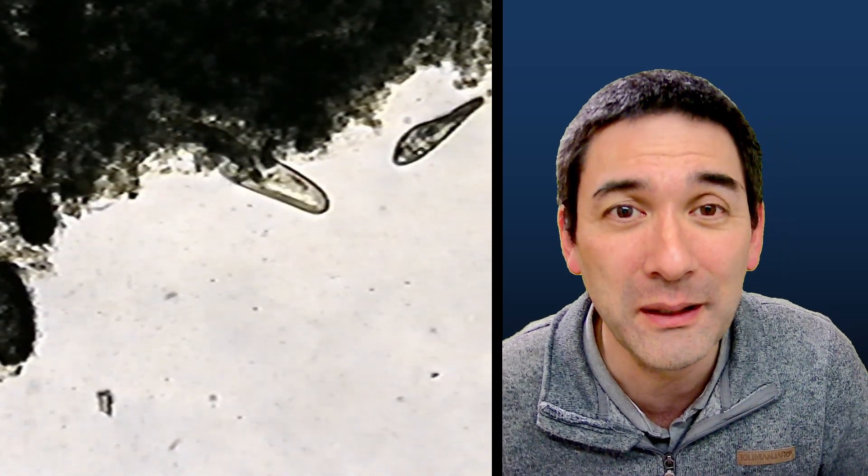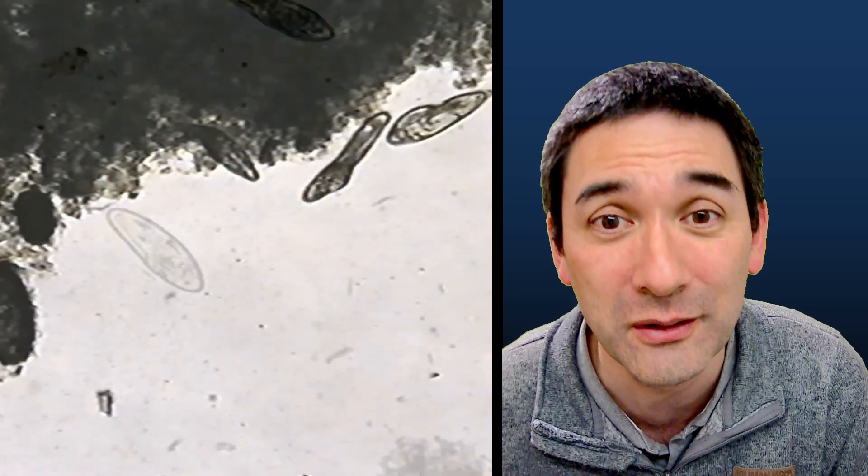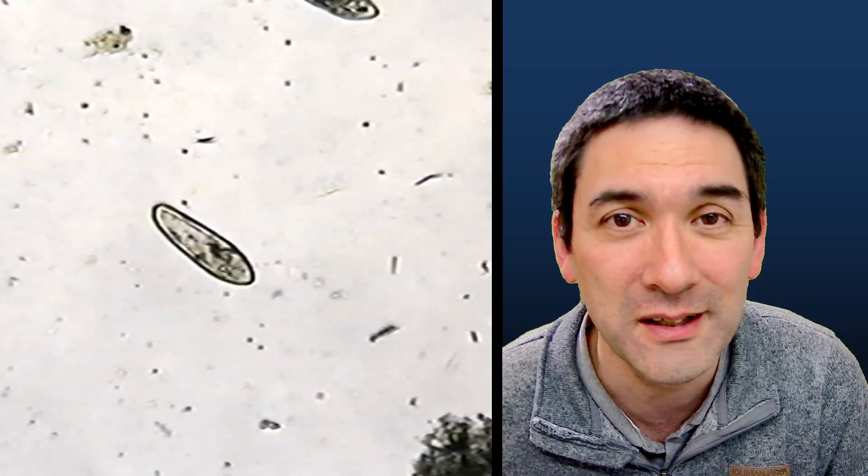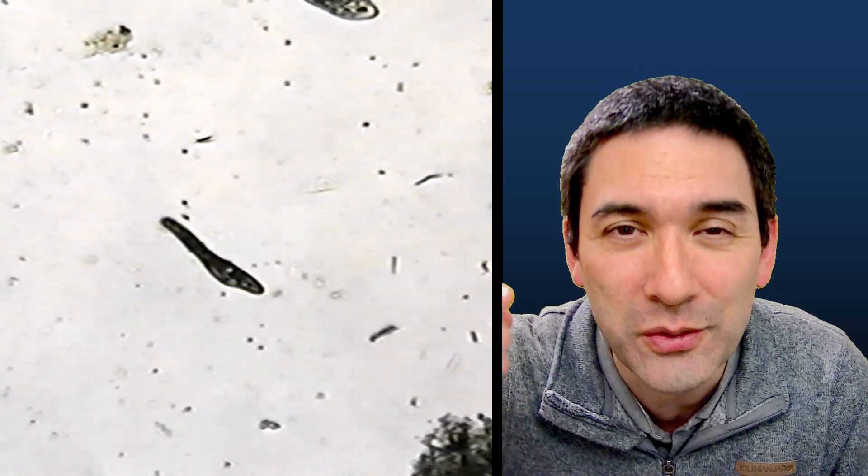So I kind of like it all the time when simple experiments are able to demonstrate some relatively important phenomena. Here, that is the last one over here, and very thin as it rotates. You can actually see that it looks quite thin.